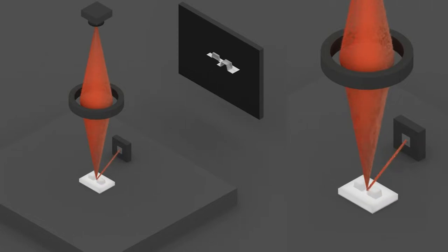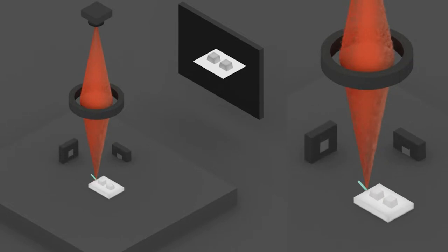The magnification of the SEM is the ratio of the point-by-point constructed image over the actual scan area of the sample. Because the position of the electron beam can be extremely fine controlled, we can get an extremely large magnification.